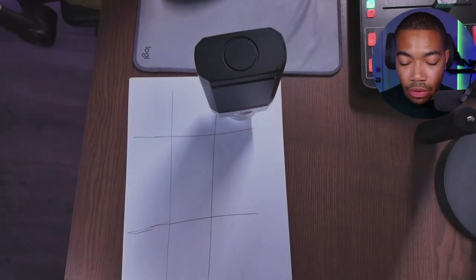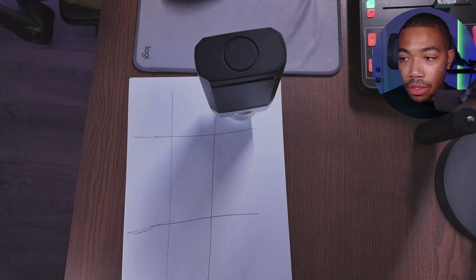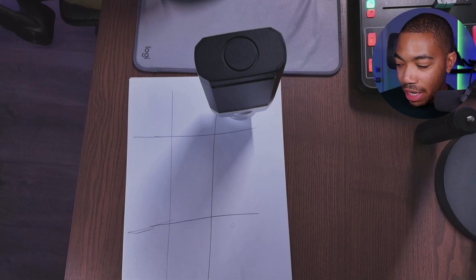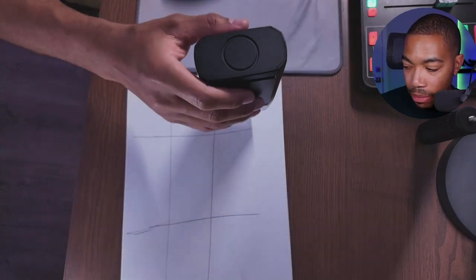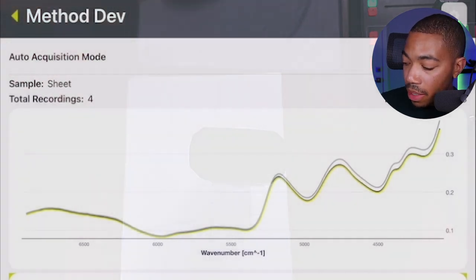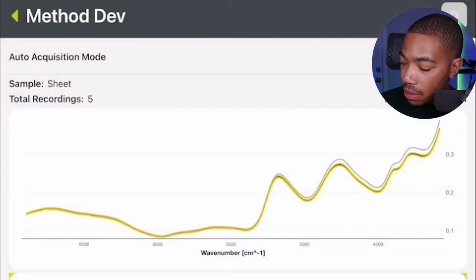And so I'll begin the first square, and every time this flashes, I'll move it to the next location. It starts after about 10 seconds. And so I've got to keep an eye on when to move it and tracking the data. So I'll switch back and forth between the cams and let you see what's going on. So far they look pretty consistent. And we're just going to continue moving until we see which sample looks kind of wonky.